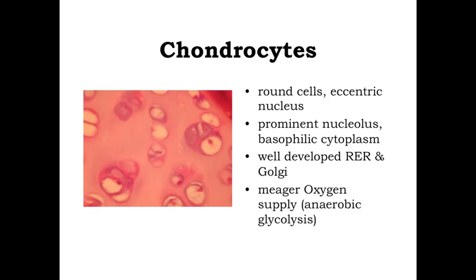If we take a look at it, again, focus in on this as a specialized connective tissue. And so we're going to have cells that are going to be scattered away from one another. Within the cartilage, the cells are going to be known as chondrocytes. And so what we're going to see are kind of rounder or oval cells. They're often going to have an eccentric nucleus.